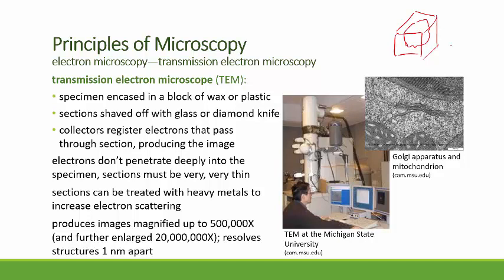And then you use a special knife. It's often done just with a piece of glass that has been freshly broken, so that you get this super sharp edge. Or they use diamond knives as well. Again, diamonds that have been fractured, but they're super hard. Every time you set up a microtome, you would make a new glass blade, whereas a diamond knife would last longer. But you then shave off thin slices. It's almost like shaving cheese off of a block of cheese.